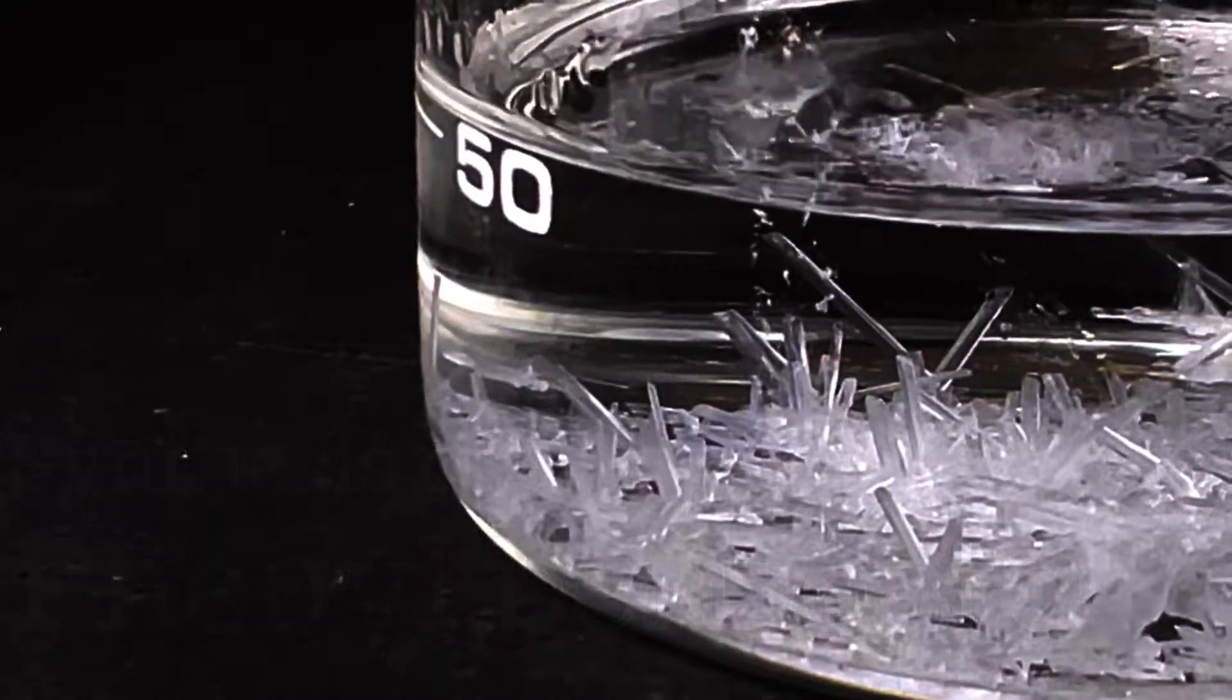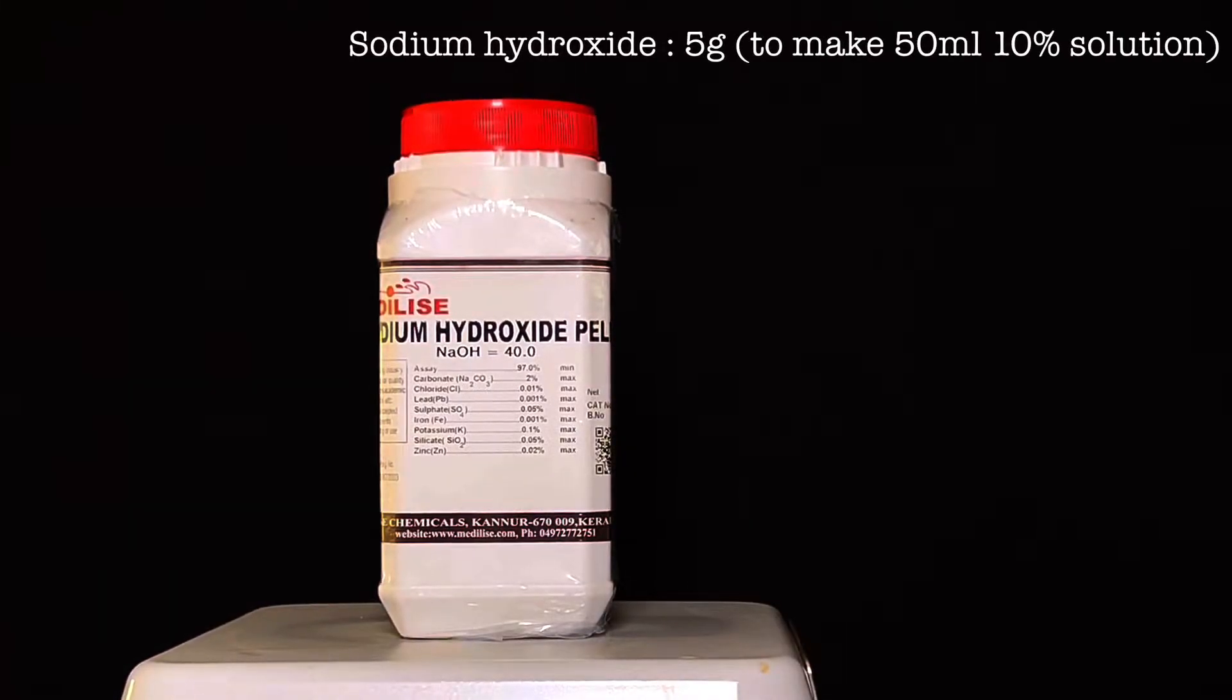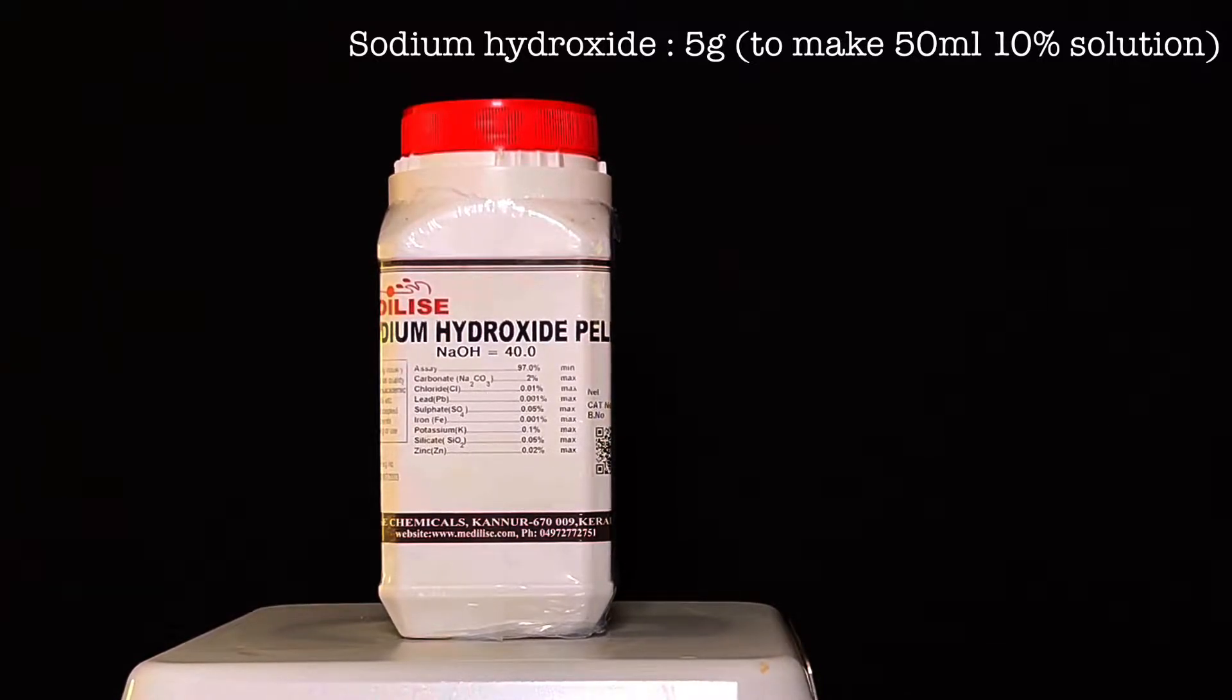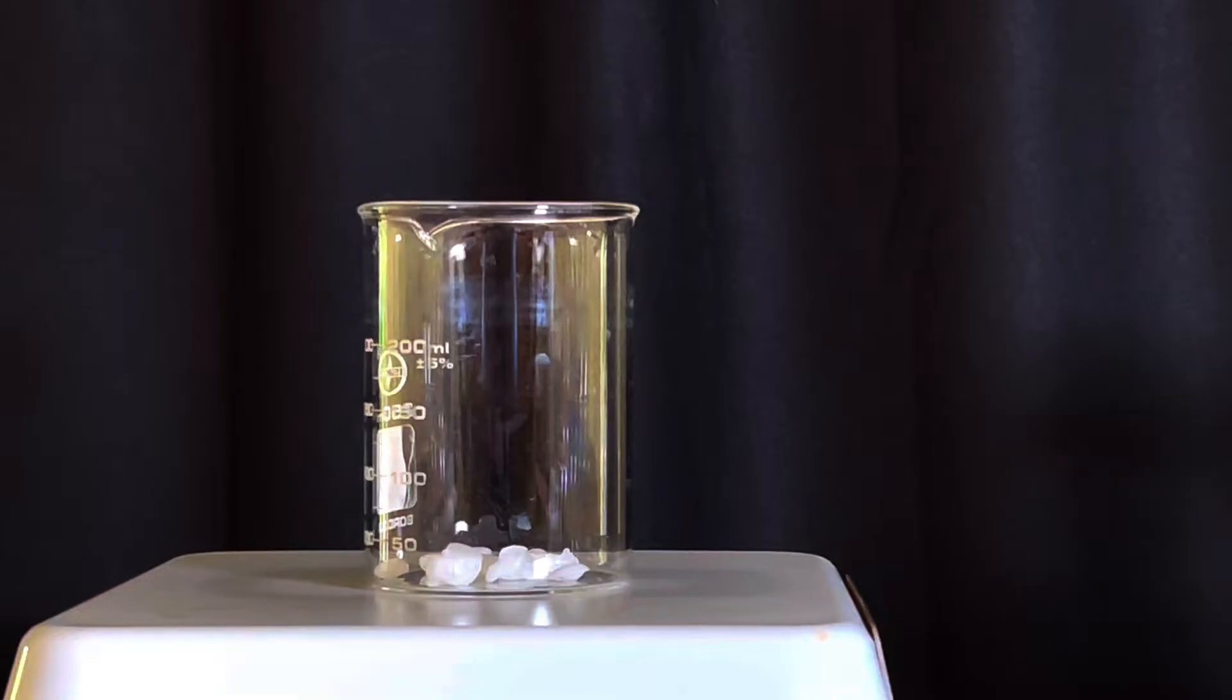For this experiment you will need 2.5 grams of phenol crystals, 5 grams of sodium hydroxide pellets to make 50 ml of a 10% solution, and 5 ml of benzoyl chloride.